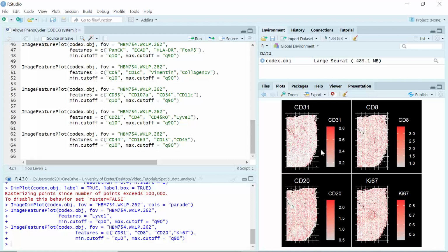Actually, even though we produced the image, this is not the real image that was taken by the microscope. So if you want to see the protein expression pattern on the real image, you can watch my future video tutorial for the Spatial software.